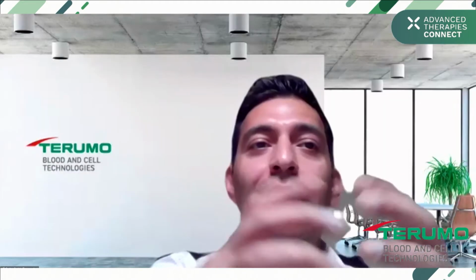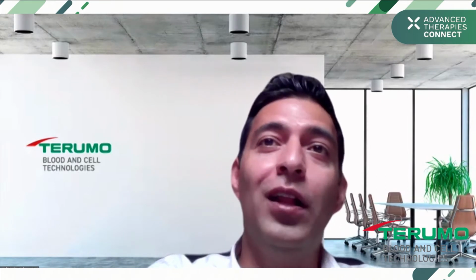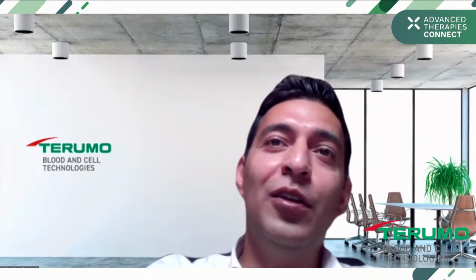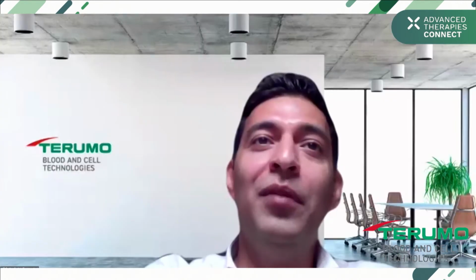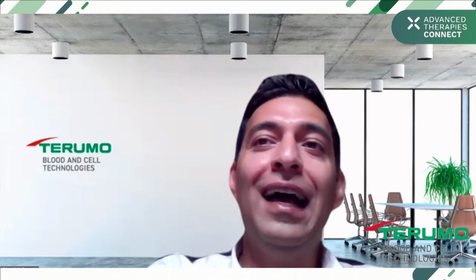Very good points, Elena. I think you summarized it pretty well, that you should consider automation very early, but keep in mind, as all the panelists touched on, that your product shouldn't be impacted. And Amina pointed out really well, if you go fast too early and automate the process for a product like CAR-T, persistence is the key. If the persistence is not there, you have to go back and check how the changes you made impacted it. So understand the product, think about automation early, and keep that flexibility.